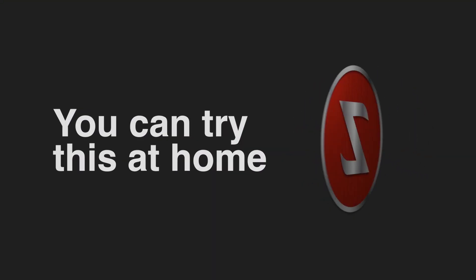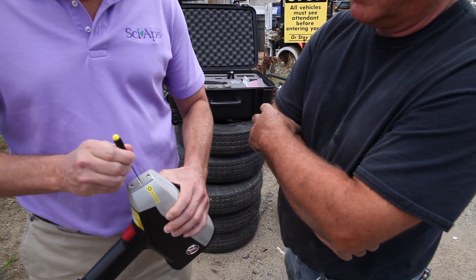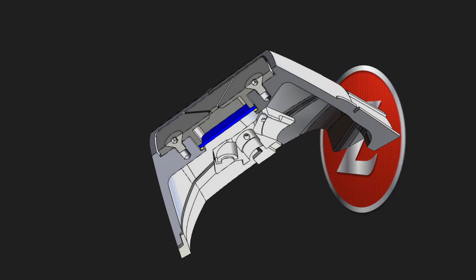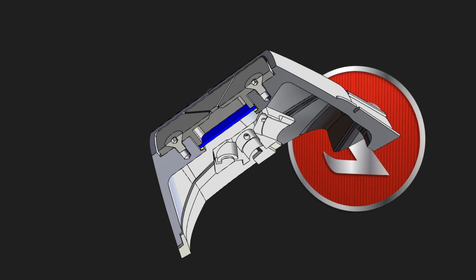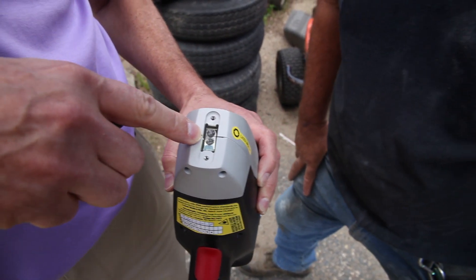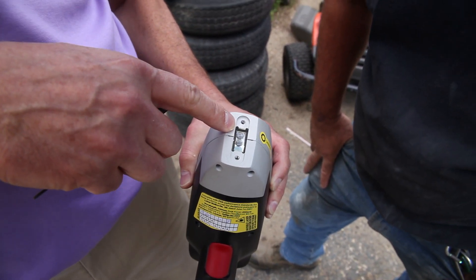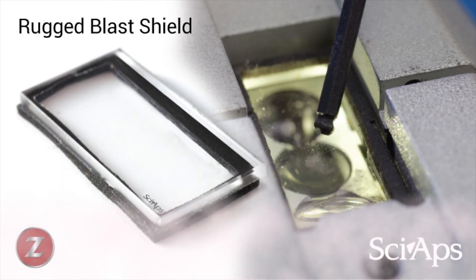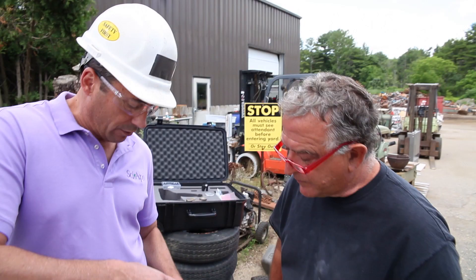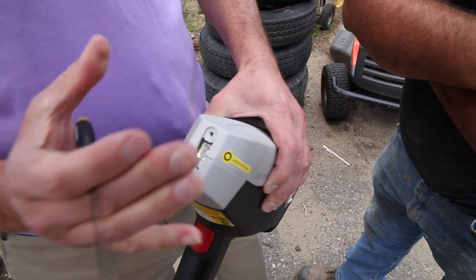What I like to show people as an example — this is a little hex rod. Here's the window. I mean, I could do this all day long. You're not going to break anything. I'm just going to pop off this window real quick. Because you're looking at optical light, not x-rays, there's a quartz shield. The middle thing is the laser — that's where the laser comes out. The lens up top is what collects the light from the analysis, and the lens down there is the camera looking in. Since that's thick quartz, you can't penetrate that. You're going to whack on this thing all day long, and there's no detector to break.